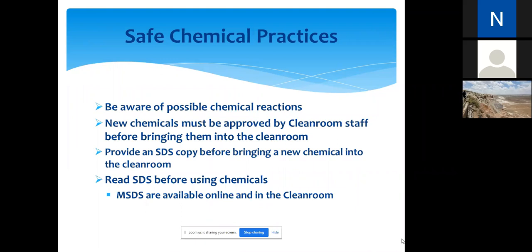So be aware of chemical reactions that happen when you're not watching, especially those that could possibly happen after you have left them. Some chemicals, you can't just say it's done, I have mixed A and B, and therefore I'm going to put this in a waste jar. You may need to hang on to it with a label on it until the following day when you can safely dispose of it.